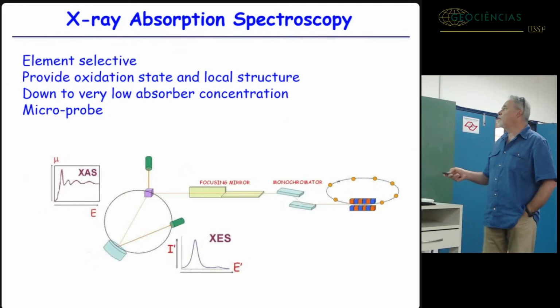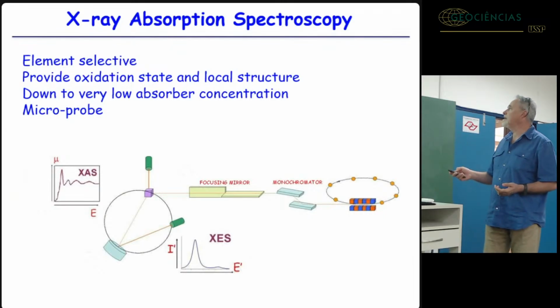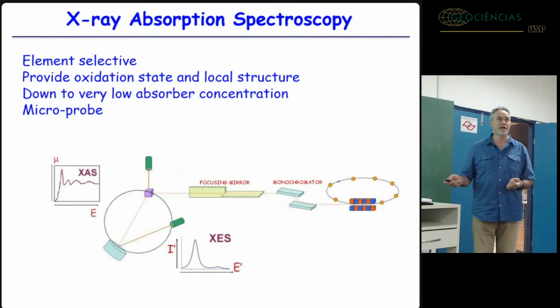And then, according to which kind of detector you use, and in general on the setting of the experiment, you may study the X-rays emitted by the sample in response to the incoming radiation, or how much this sample absorbs X-rays.